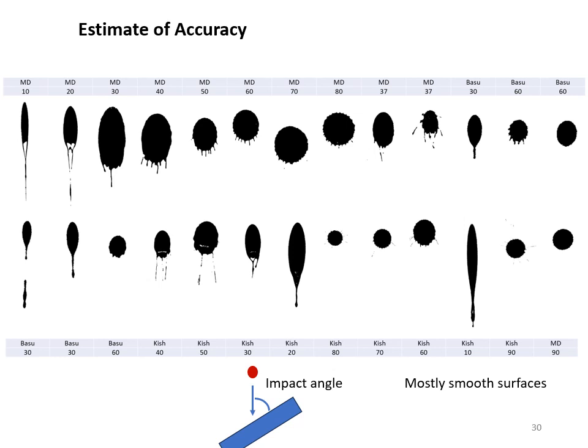So look at this. And then I used the code to extract the impact angle. You see here the ellipses fitted, and the numbers are the impact angles. And then I compared those numbers to the ones that are provided in the literature.